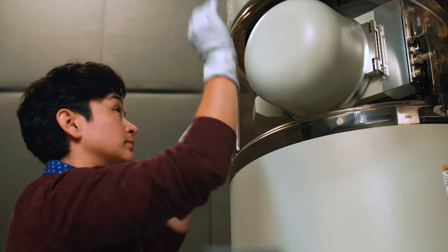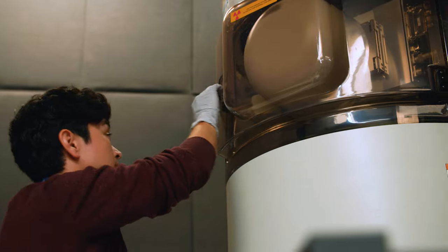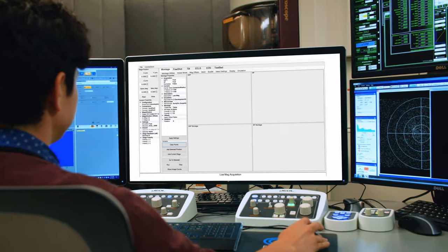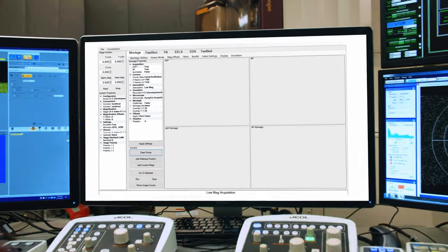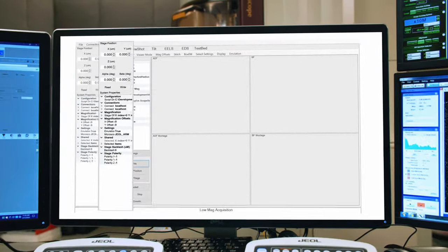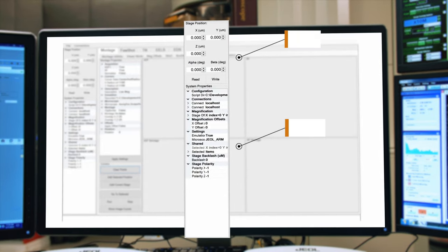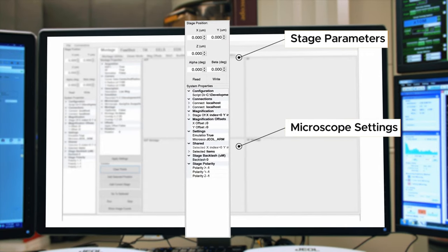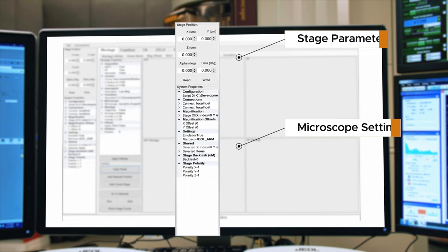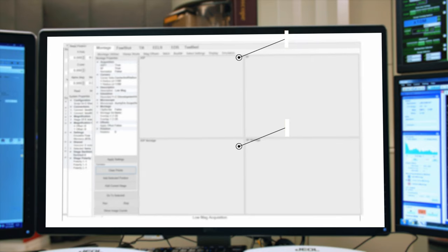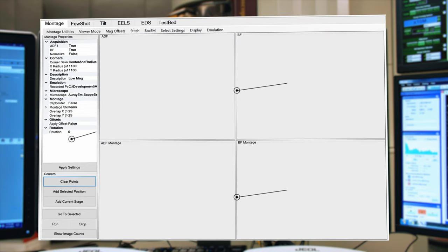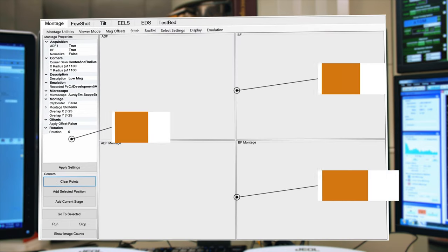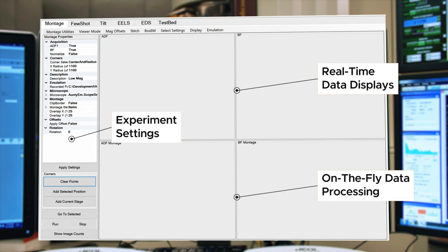The AUTO-EM interface provides a seamless experience for users to interact with the microscope and program their experiments. Users can easily set parameters to meet their specific needs. Real-time data displays allow users to visualize the data as it is being collected and processed.